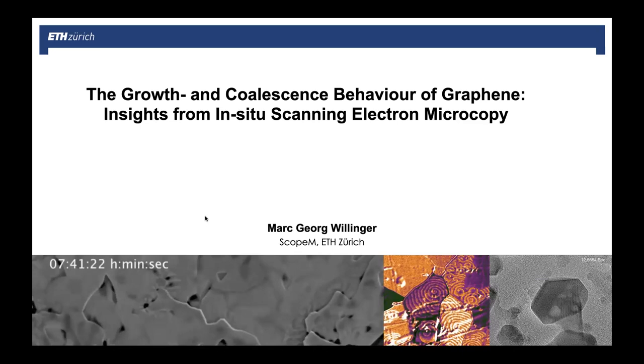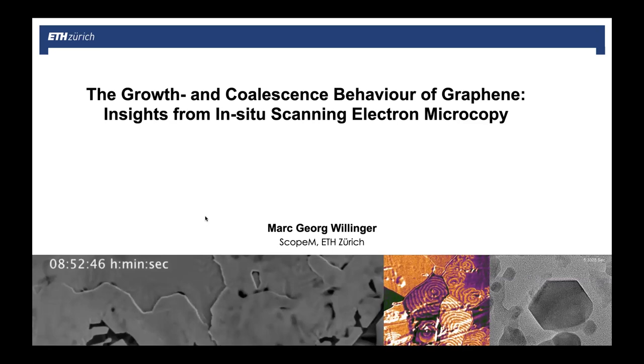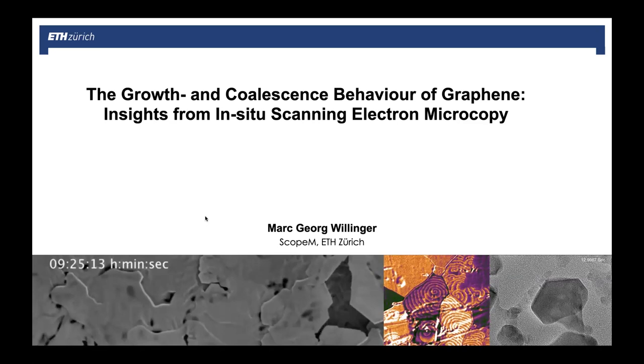But at one point I started to go away from just imaging static objects in vacuum. And I wanted to do stuff like, when something is going on, something is happening. And so I went into this in-situ field. And today I will speak a bit about our work on graphene growth.